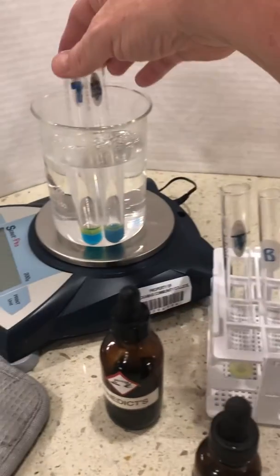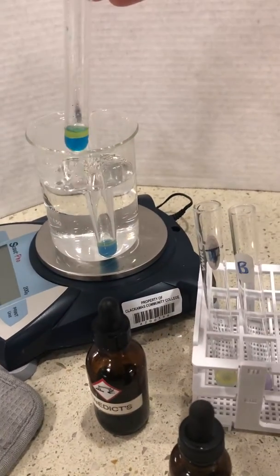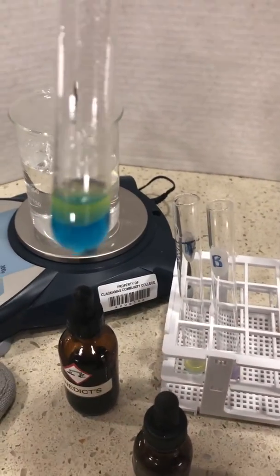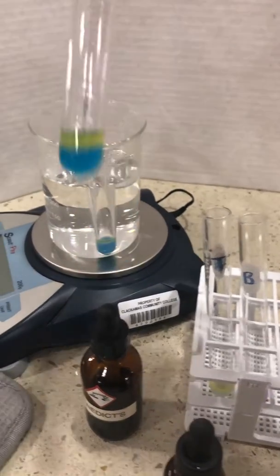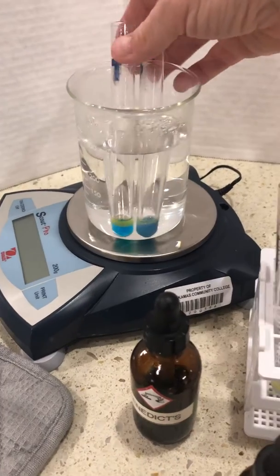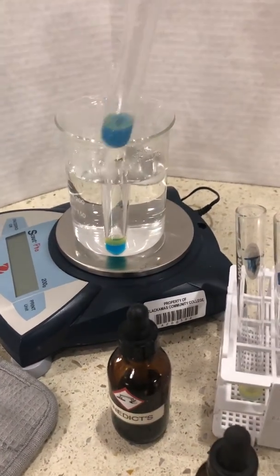A similar result is in the Benedict's. If you notice the top layer of the Benedict's, it also has the butter floating on top with the blue Benedict's beneath it. Here's the result for the bottom layer with Benedict's.